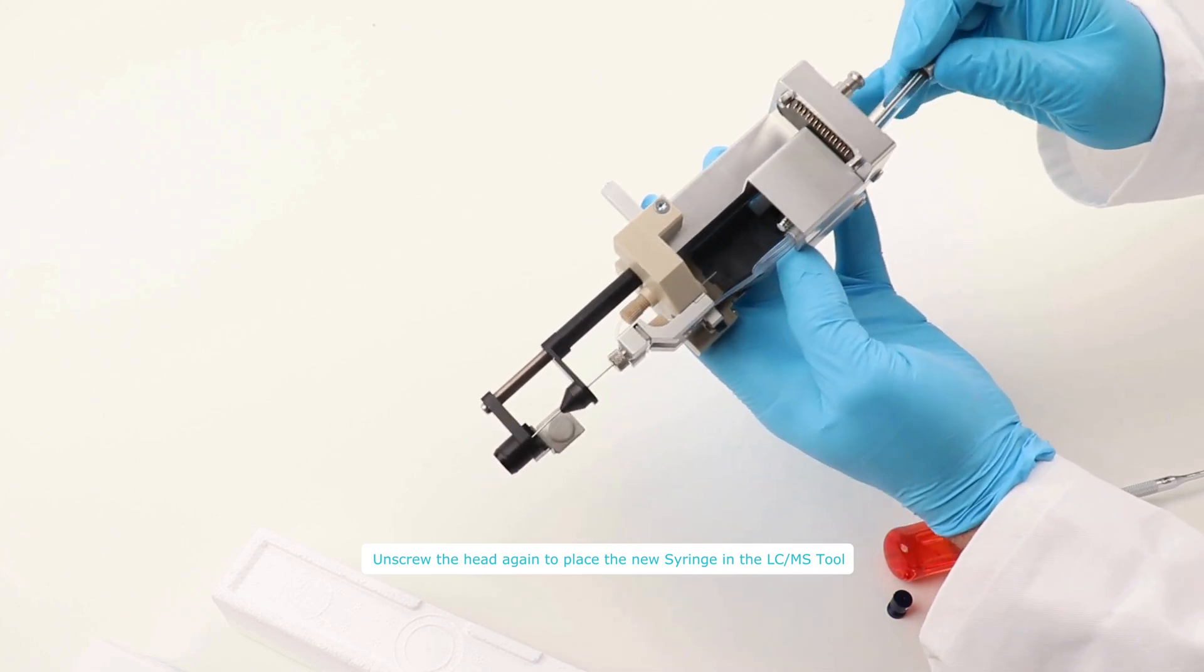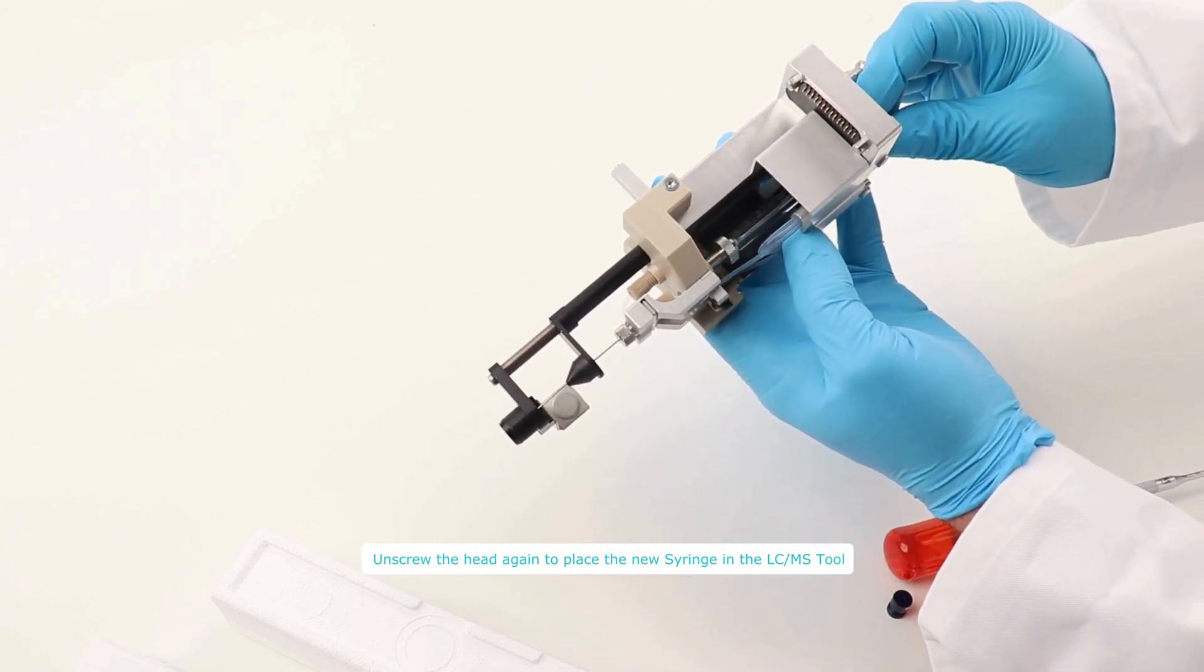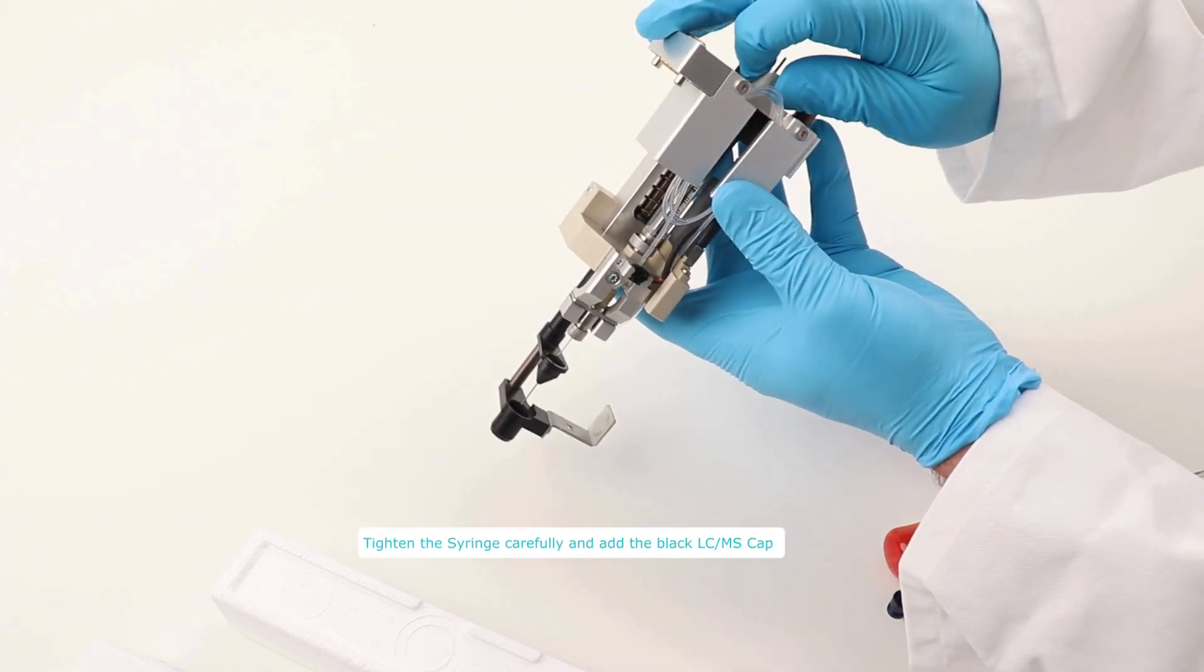Carefully insert the new syringe into the LC-MS tool and securely fasten it. Pay attention that the needle enters smoothly. Once the new syringe is in place, screw it in.